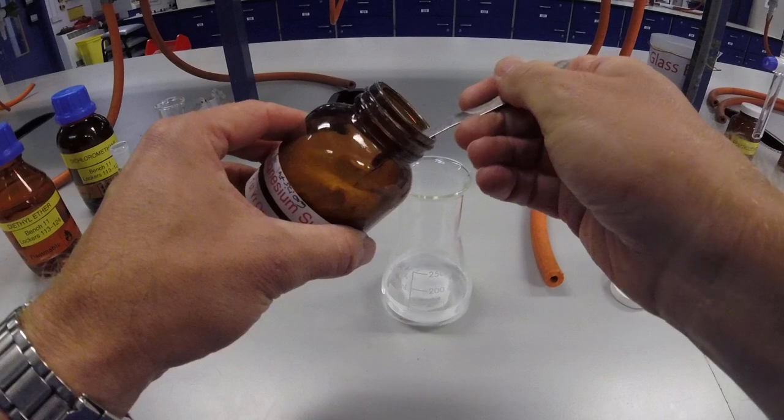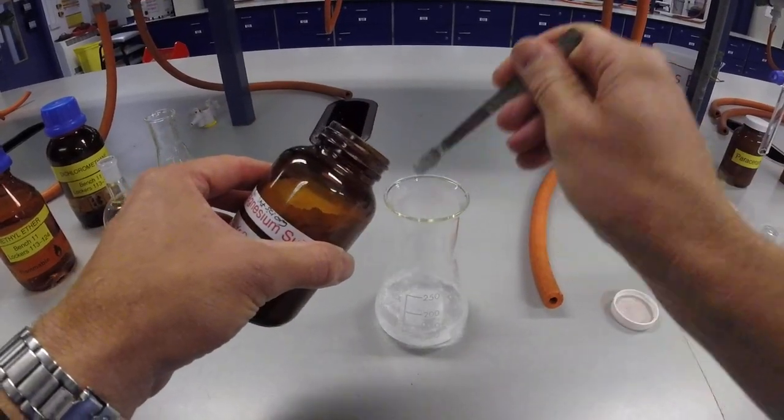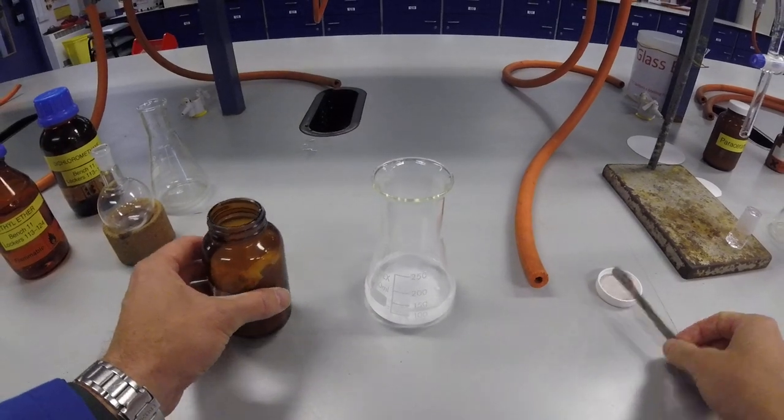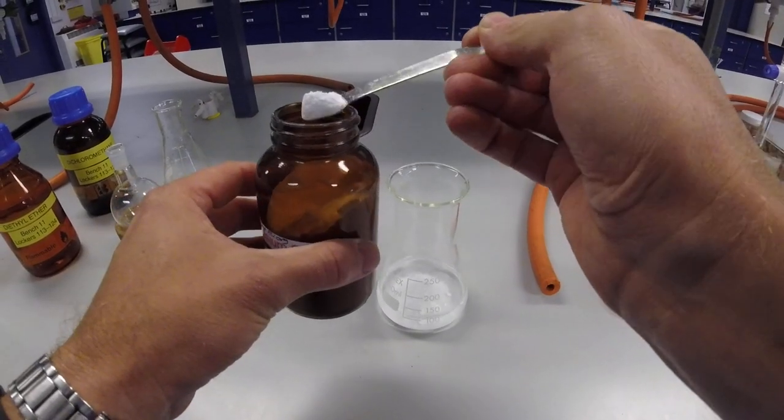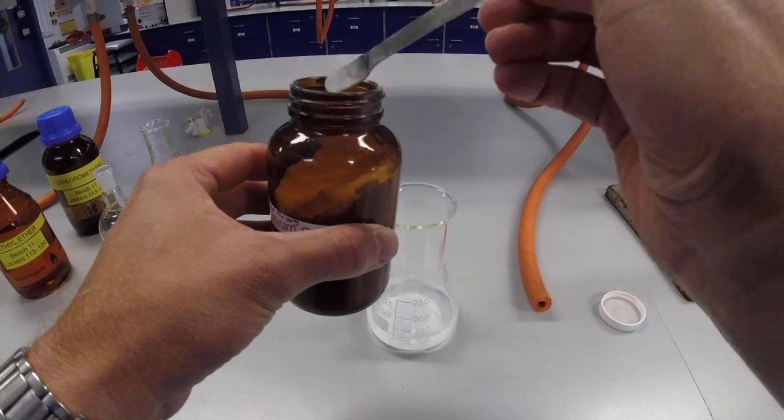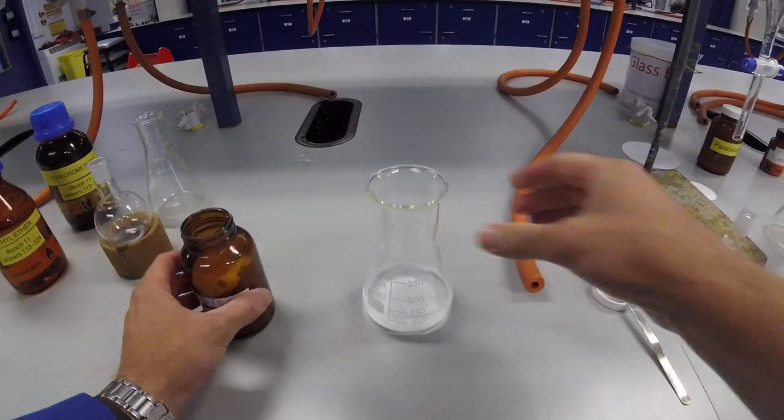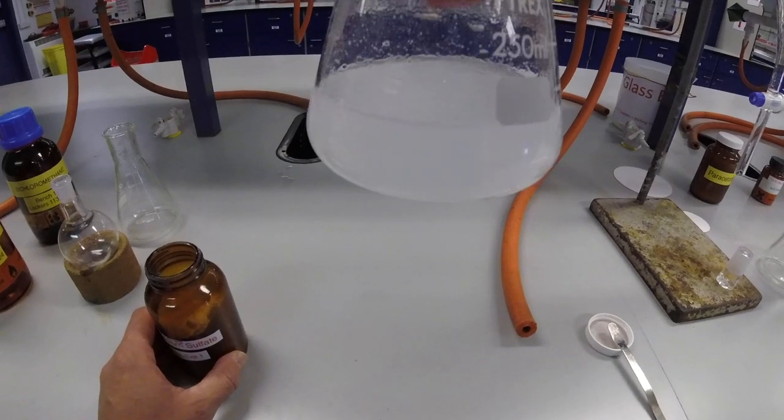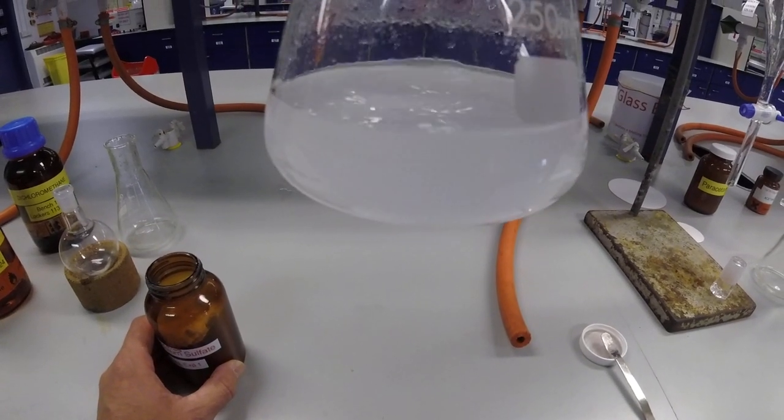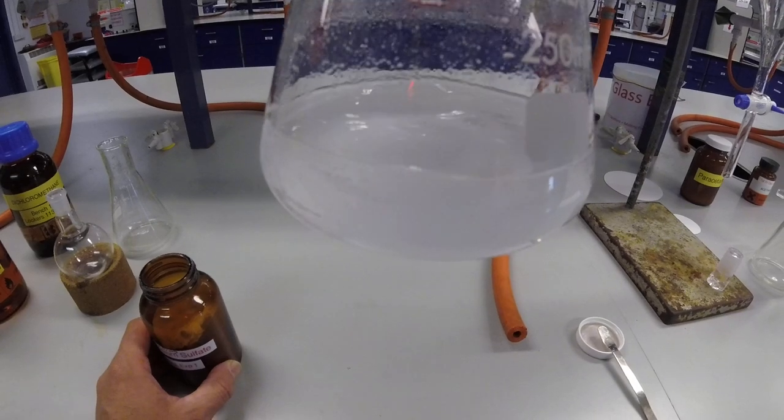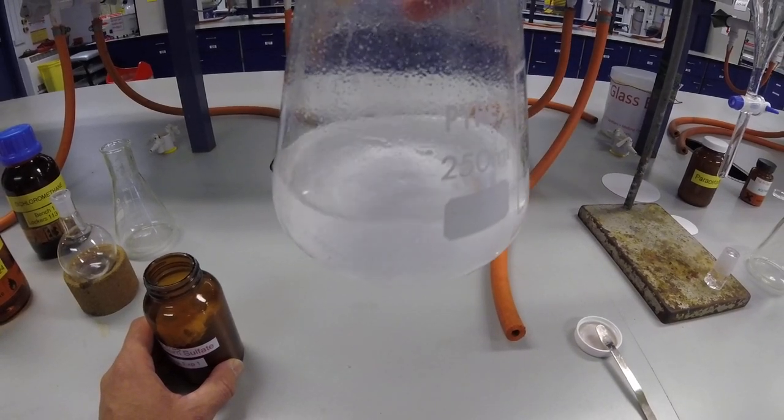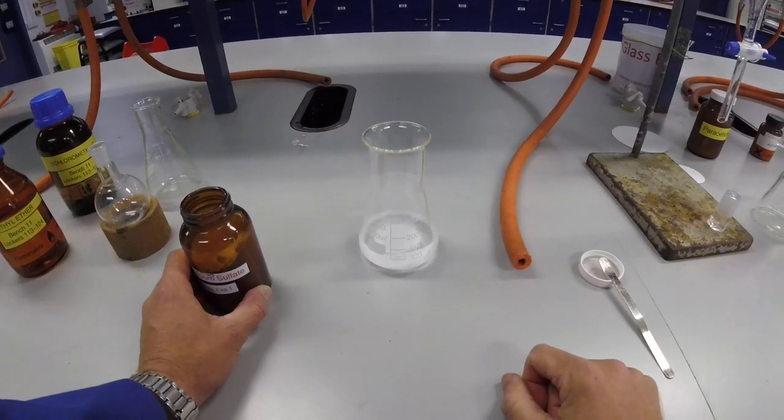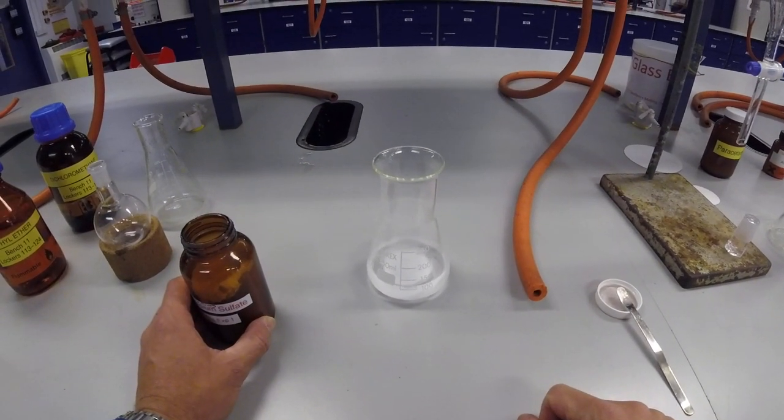Once you add enough magnesium sulfate, then the magnesium sulfate, as you can see, it's a very fine powder. And it will then swirl around a bit like, essentially, a sort of toy snow globe. Hopefully you can see that happening here. It's very, very freely flowing, and it settles slowly to the bottom. And at that point, you've dried your solvent, and you're ready to filter off and remove that magnesium sulfate.